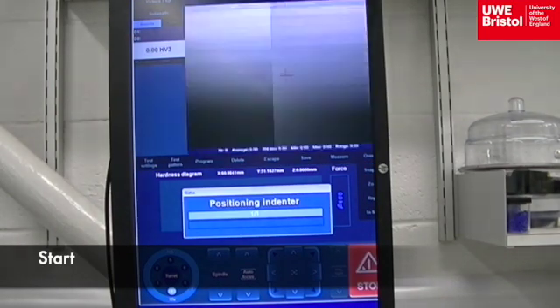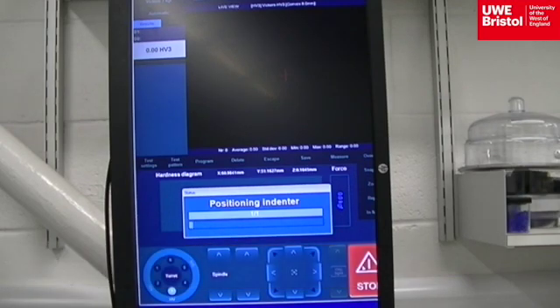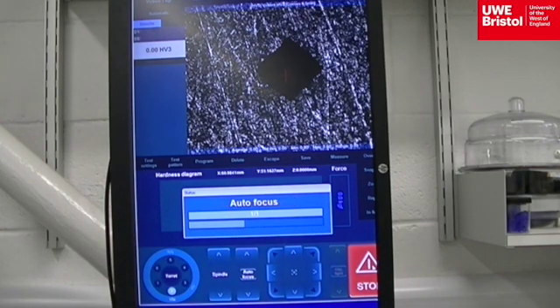The indenter automatically rotates itself over the specimen and then lowers itself and loads onto the specimen 3kg force. After 10 seconds it retracts and the magnifying lens rotates back over the specimen where the indentation can be viewed on screen.